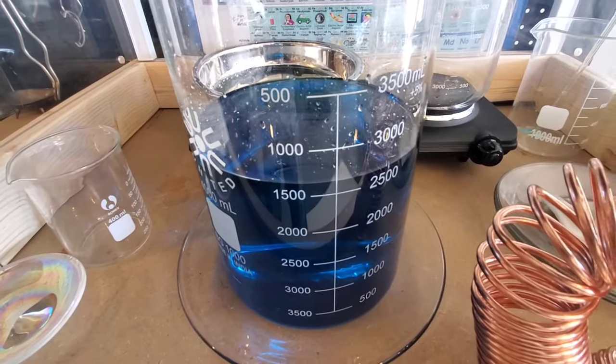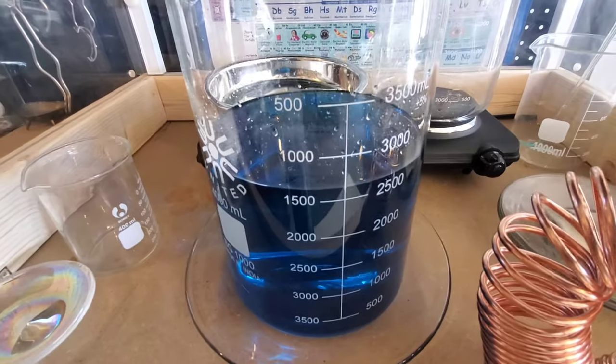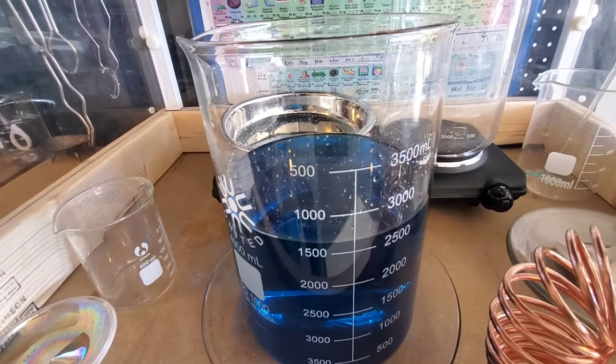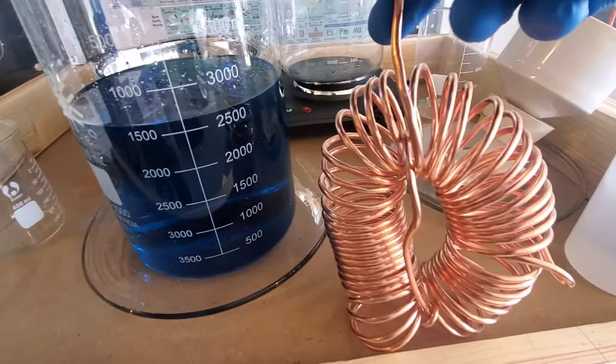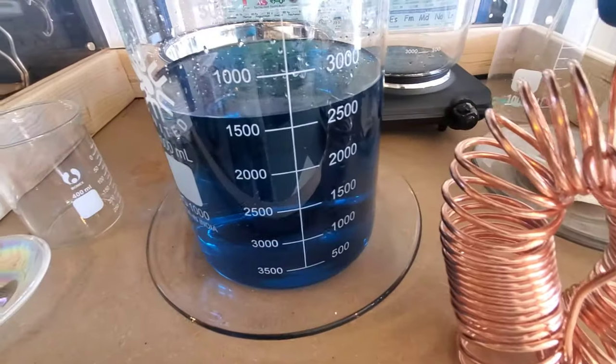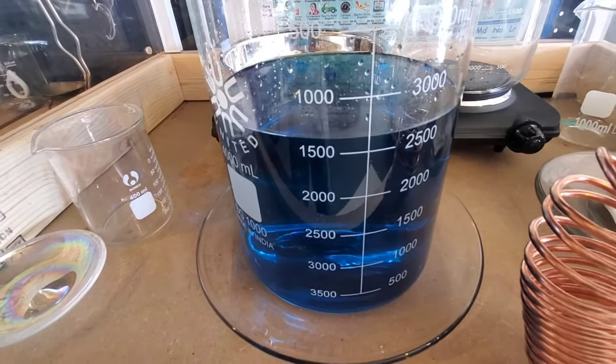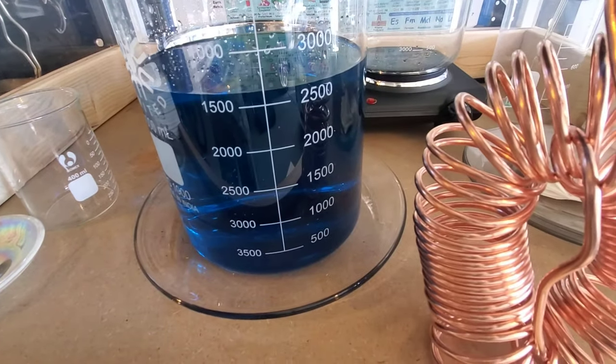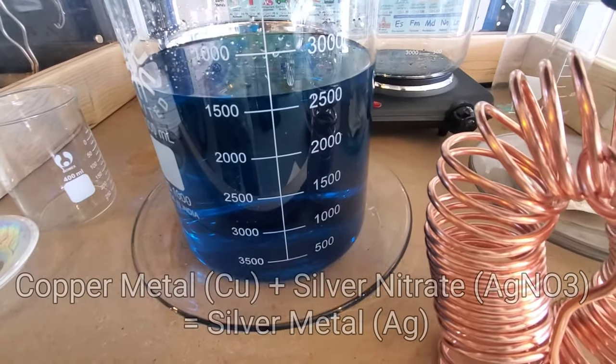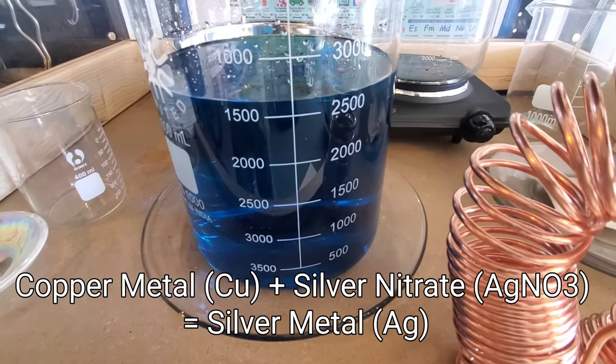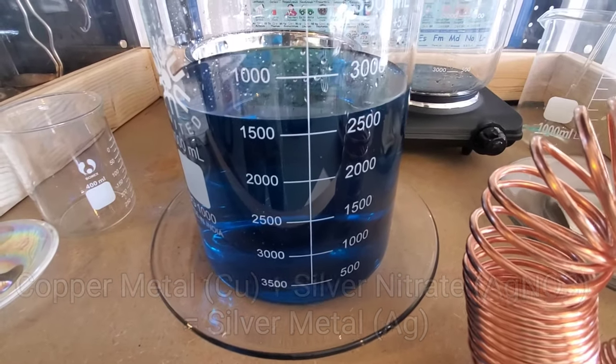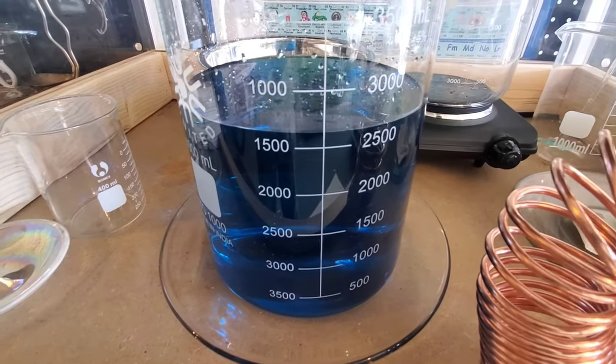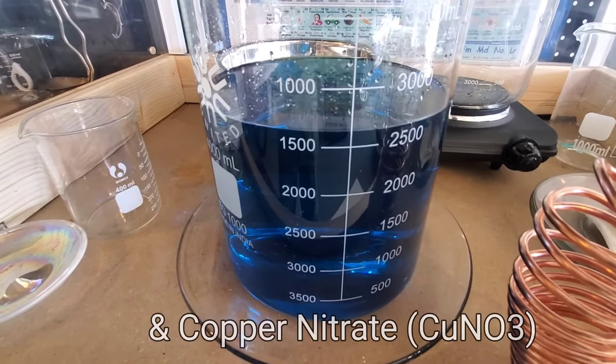I've transferred my silver nitrate back into this large beaker. Now it's time to place the copper wire into the silver nitrate. The silver nitrate will exchange ions with the copper, turning the silver nitrate back into a solid state of silver. And then the copper will actually change into a copper nitrate.